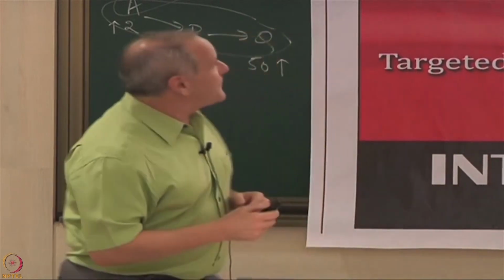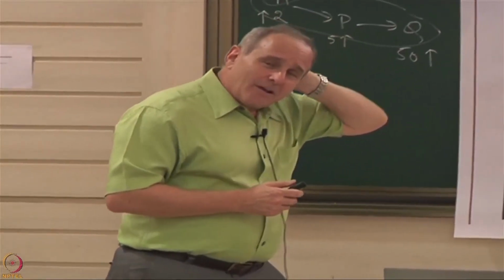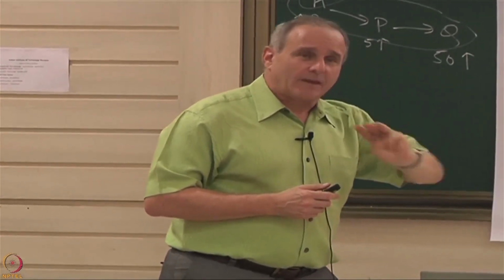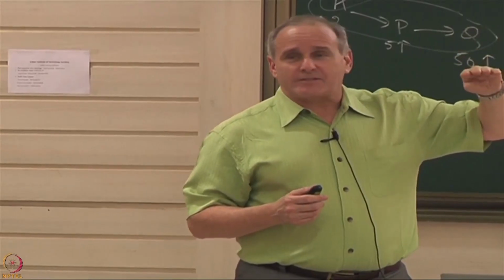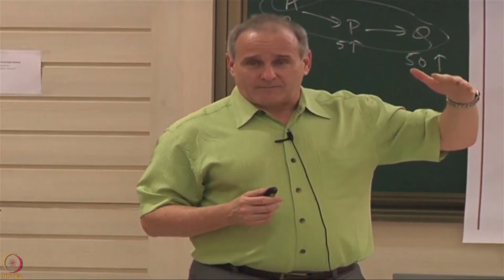All right, so this is how we outlined the study. For complicated reasons, we decided not to use 5 spots for 5 proteins per spot. We used 3 proteins per spot. Part of that was, if you remember when I started, I showed you that the number of spots that you can use depends a bit on the expected hit rate, right?